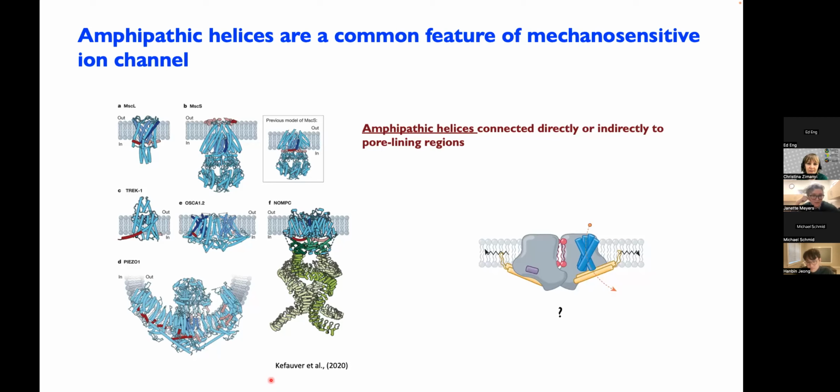Okay, and one more here. Did you directly test the benefit of liquid nitrogen cell disruption compared to other methods such as sonication or French press for this project? Did it help preserving the structure, increasing the yield? Yes, I did. We used to use sonication to break apart cells and membrane, but sometimes the sonication power is too strong and breaks the complex apart.